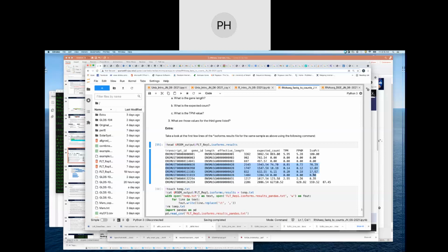And so, of course, these are all in percentages, so to get the proportion, I just divided all these numbers by 100. And then that's how I got the isoform percent that's in parentheses here. And so if you go through and do those calculations, so multiply the length of each transcript by its percent expression in your samples for that gene, you'll get values for the length of each one of these transcripts. And then you can sum it all up at the bottom.